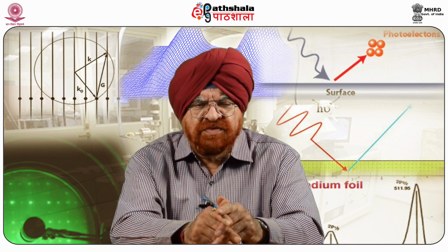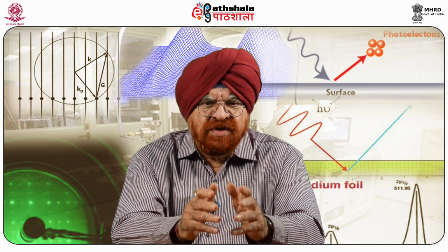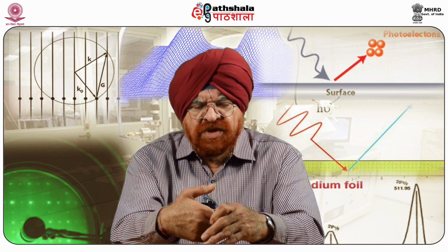The main components of a commercially available ESCA system include an X-ray source, ultra-high vacuum chamber, stainless steel chamber with UHV pumps, electron collection lens, electron energy analyzer, mu-metal magnetic field shielding, and electron detector system, moderate vacuum sample introduction chamber, sample mounts and sample stage, set of stage manipulators.